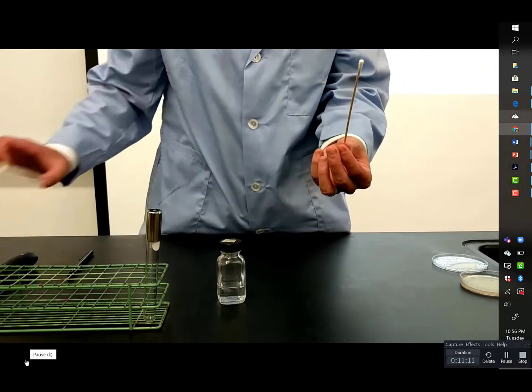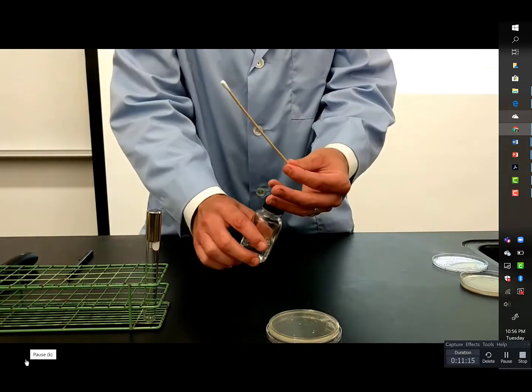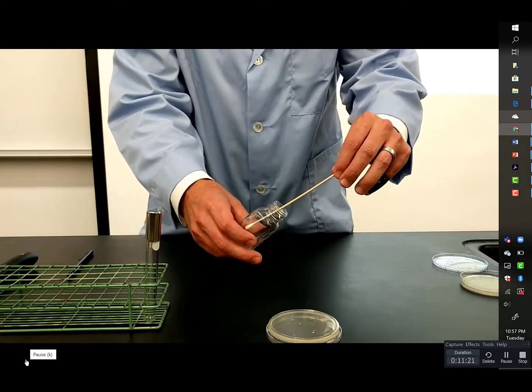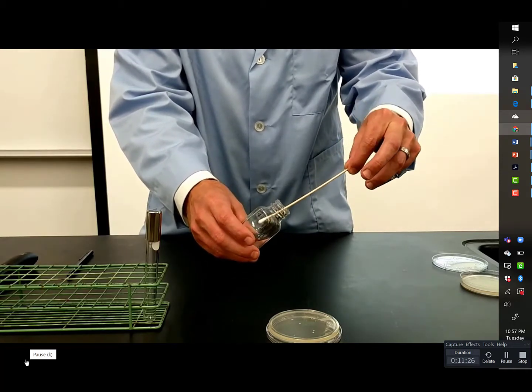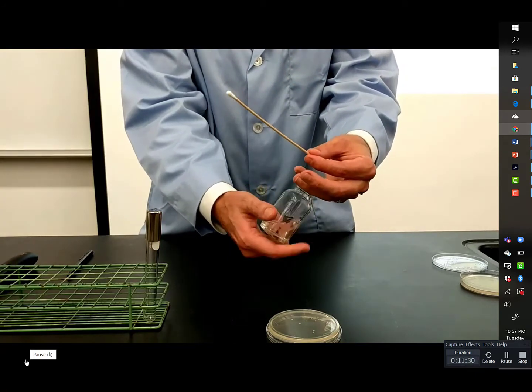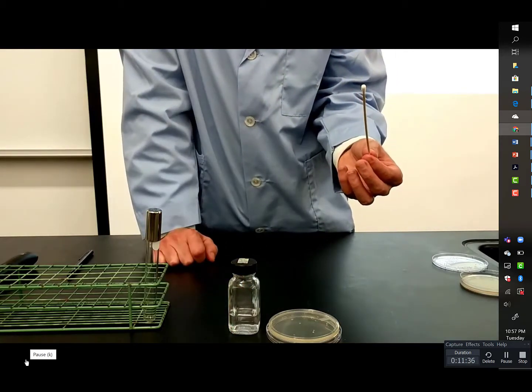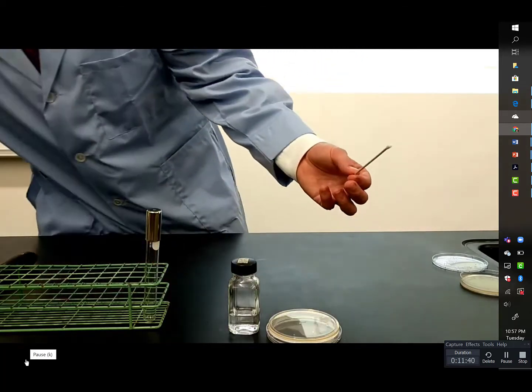Now, I have another plate that I'm going to use to sample something else. So I wet the swab. I'll carefully take off the lid, and I'll go in and wet the swab, and I don't want it to be dripping wet, so I'm going to kind of squeegee it off a little bit. And then now I need to sample something. What shall I sample? How about my cell phone?